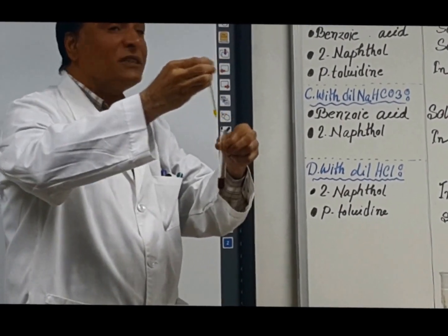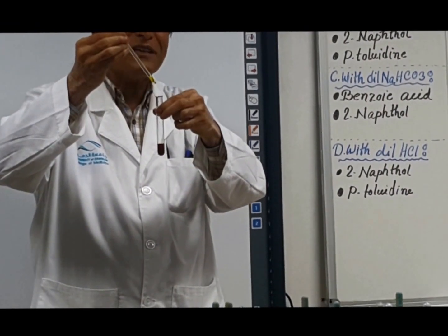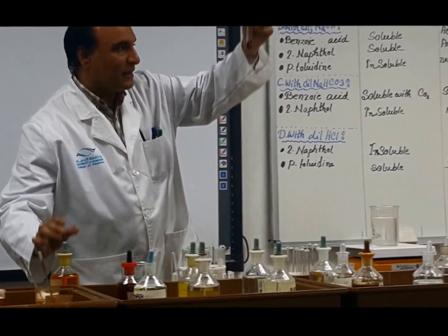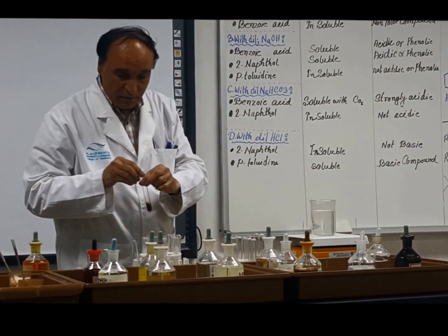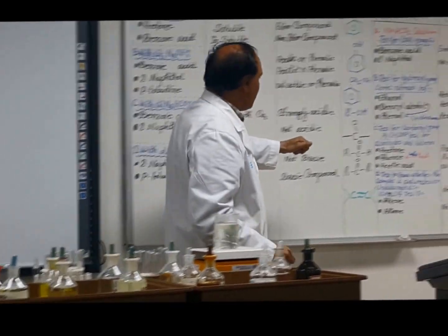So when you do such type of experiment, make sure that you don't touch it with the test tube. Do the practice. So you will see that the red color is there. Now, I will show you the test with the phenol.